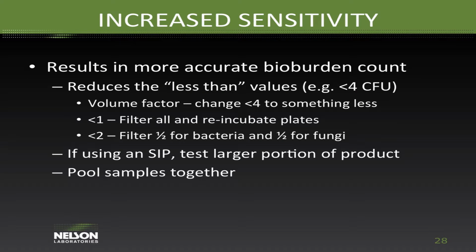All right, so increasing sensitivity in the bioburden count. Mainly what we're talking about here are less than values, and this will be something we talk about quite a bit as well in the new version of the bioburden standard. Those of you that have very low bioburden, I'm sure you're used to seeing less than. Hopefully you don't see 0. You should never see 0 in a bioburden report. Hopefully what you're seeing is less than something: less than 2, less than 4, less than 10.